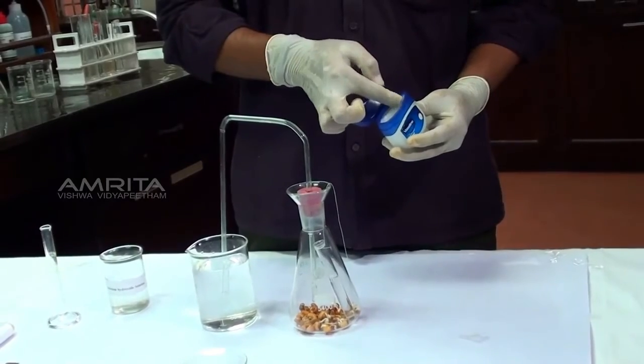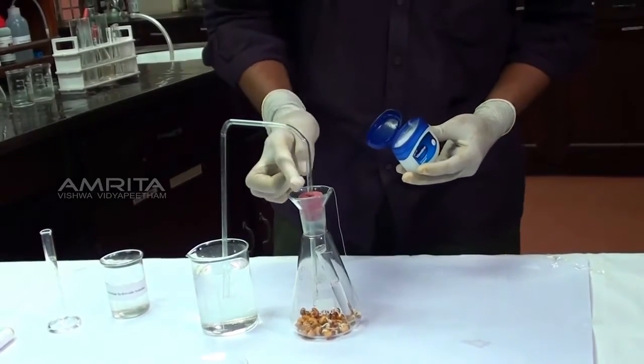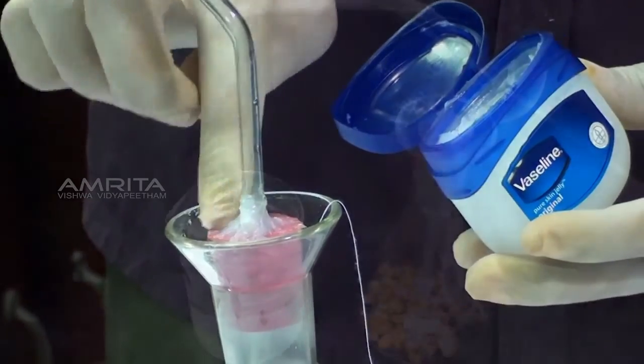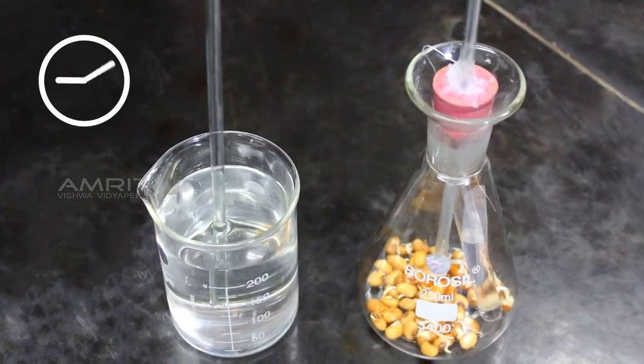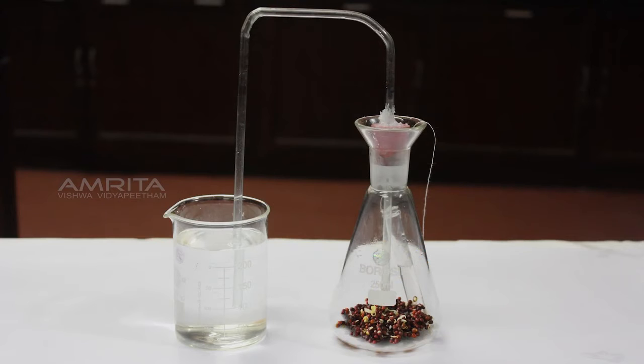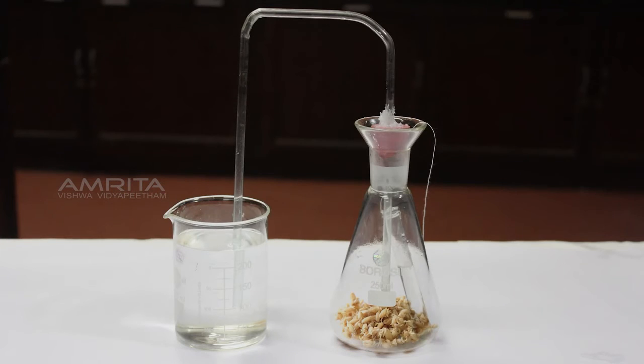Use your finger to take some petroleum jelly. Apply the petroleum jelly on the cork to make the apparatus airtight. Keep the apparatus undisturbed for 2 hours. Repeat the same procedure for mustard and wheat.